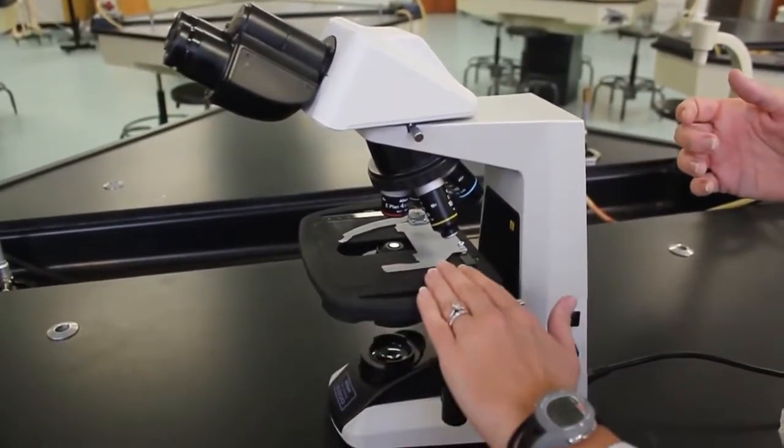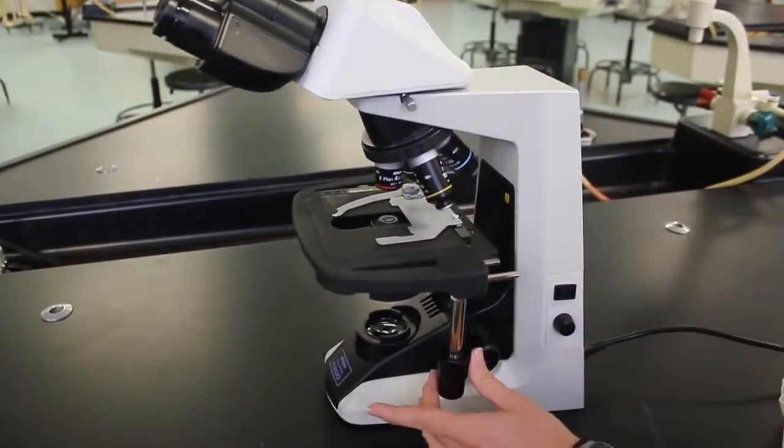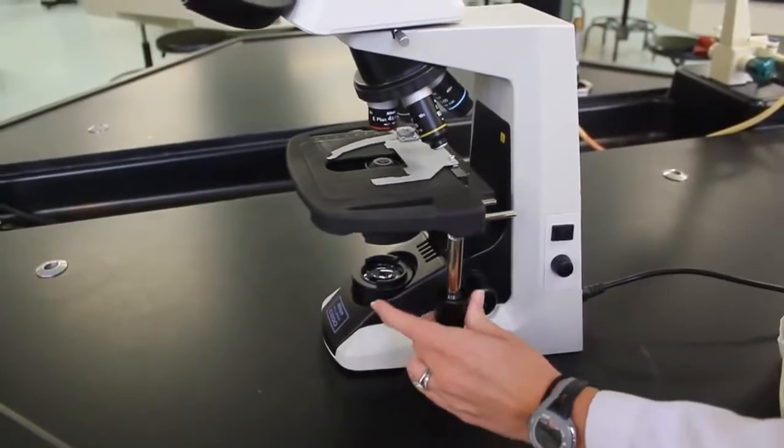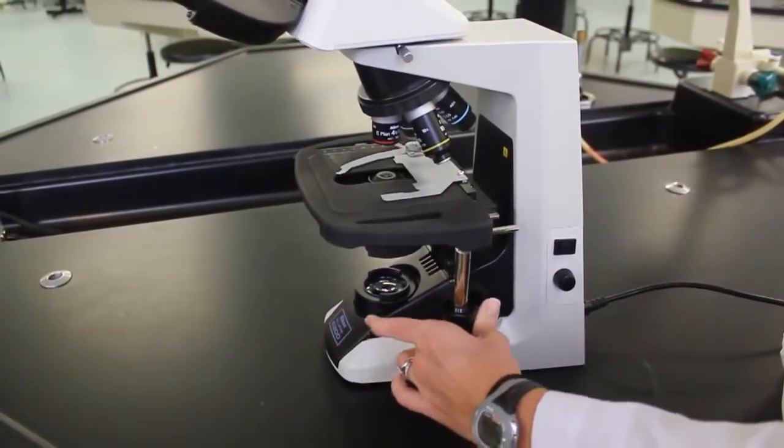This area is the stage. This is where the microscope slide is placed. These knobs allow you to move the stage to get your microscope slide in the proper orientation.